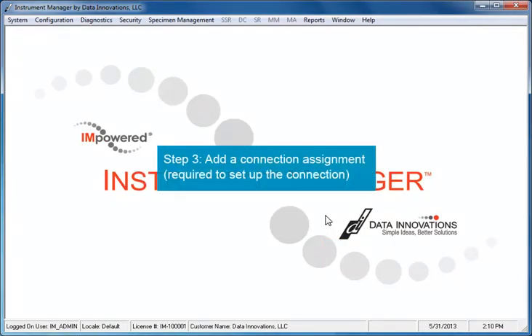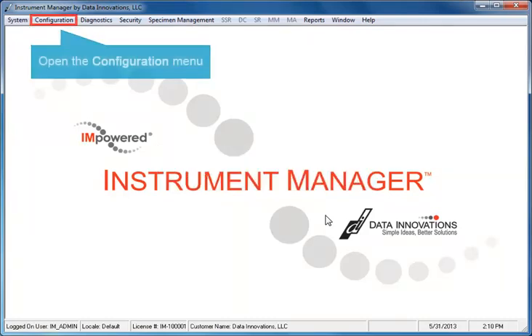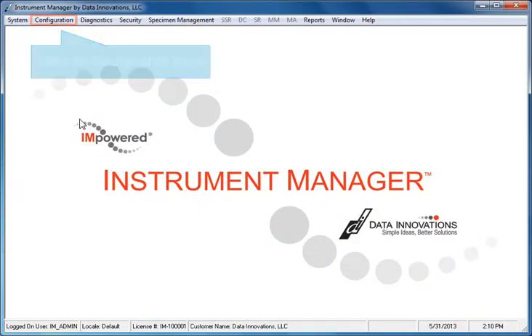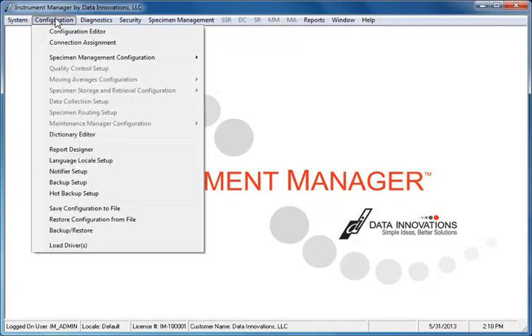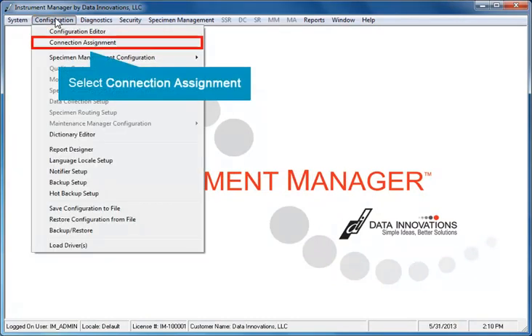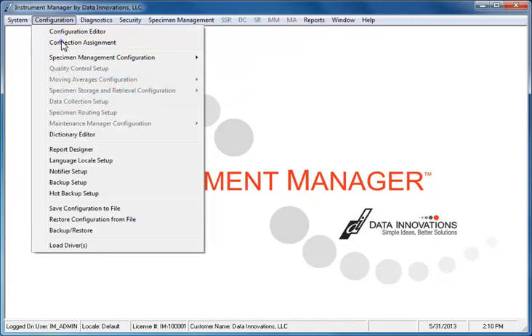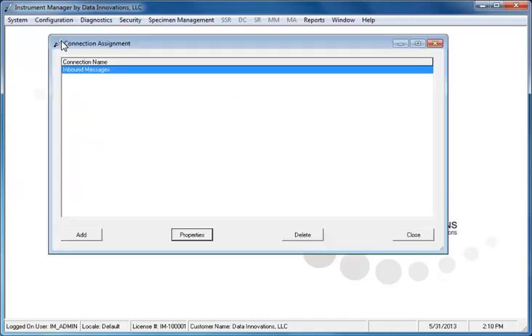Next, you must add a connection assignment for the configuration you just created. This is required to set up the connection. Open the Configuration menu and select Connection Assignment. The Connection Assignment window opens.